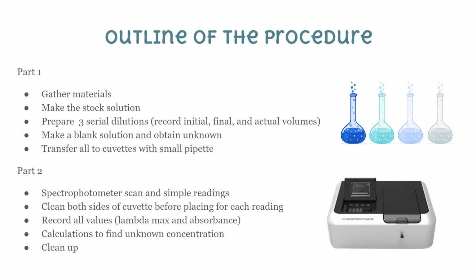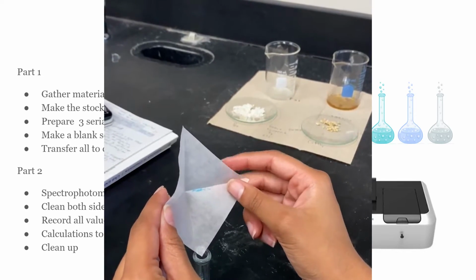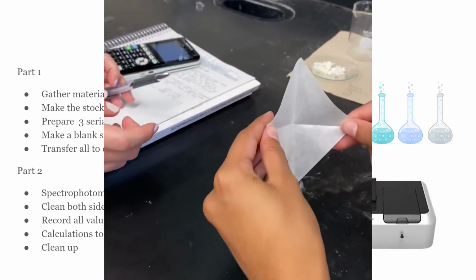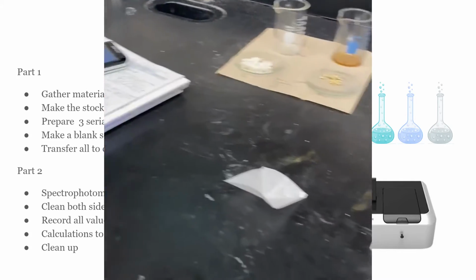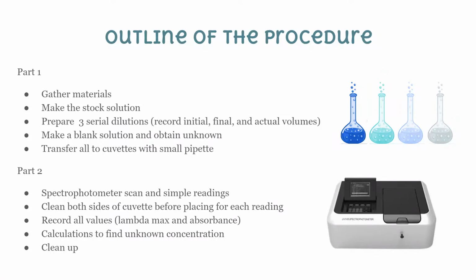After gathering your materials, it is time to create the stock solution in serial dilutions. For the stock, you will try to aim for 0.125 grams of copper sulfate. Add a small amount of water to the copper sulfate inside the volumetric flask. Once it dissolves, go to the fume hood and slowly add ammonia until the solution is a clear dark blue color. Cap the volumetric flask and mix it. You will then transfer the copper amine solution into a beaker for the next step.